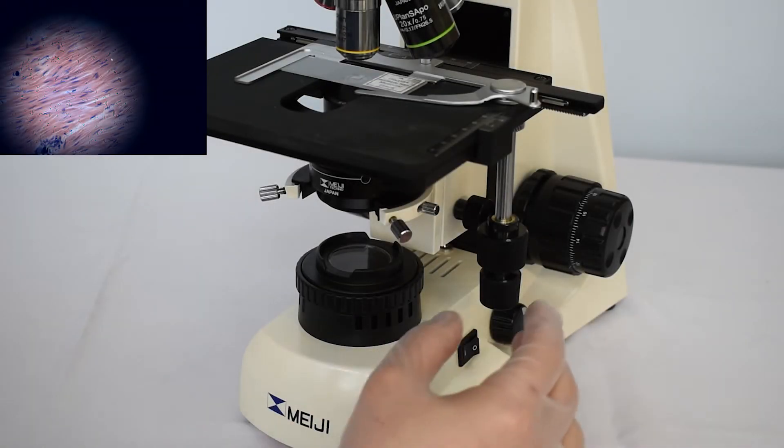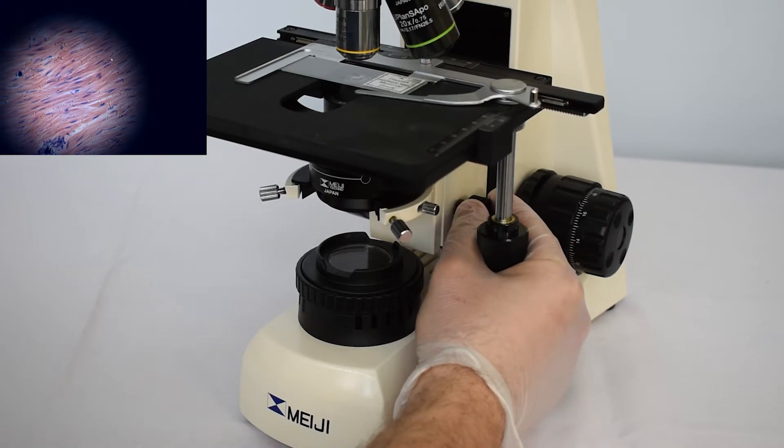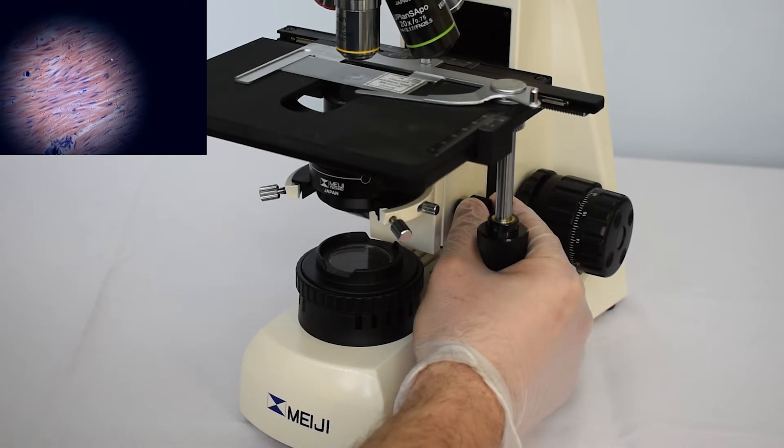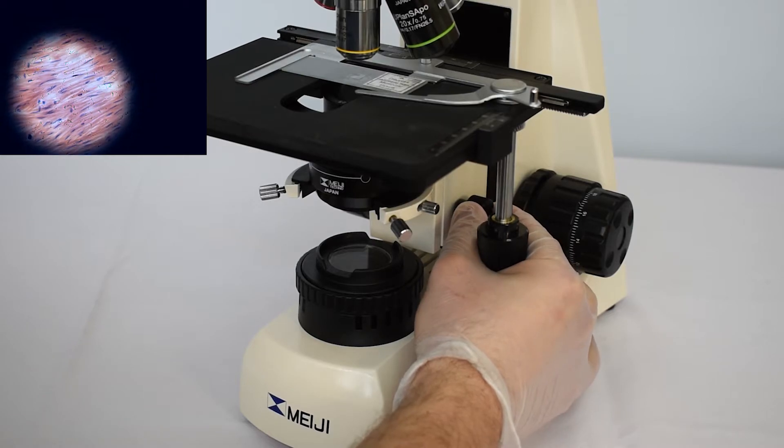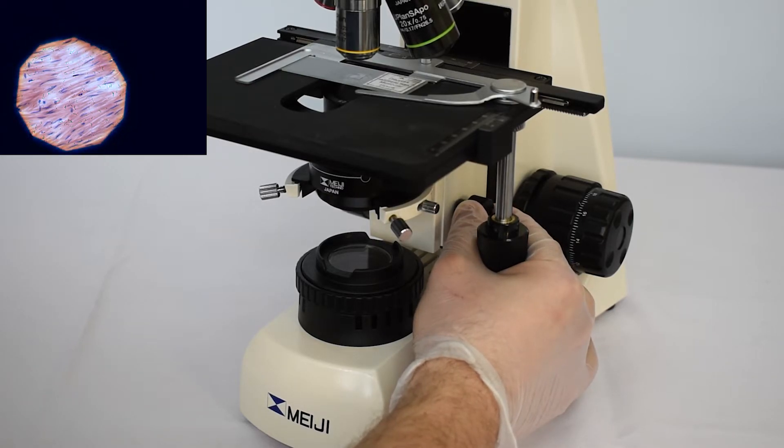Change the condenser height with the adjusting screw. It is necessary to achieve sharpness of the field diaphragm edges.